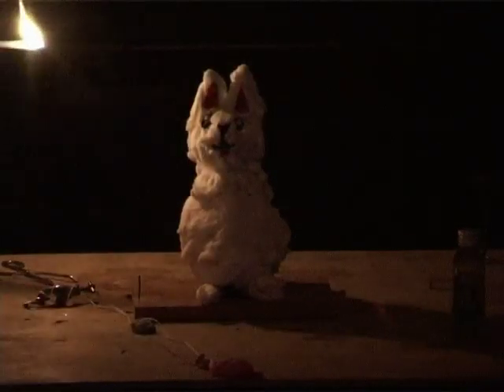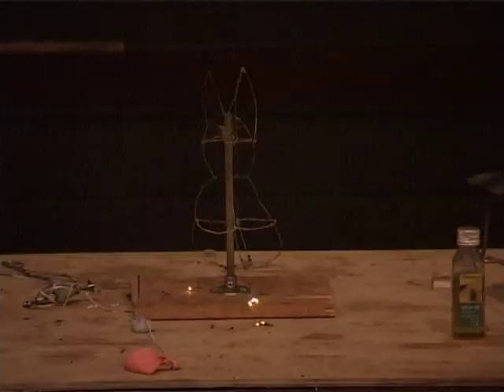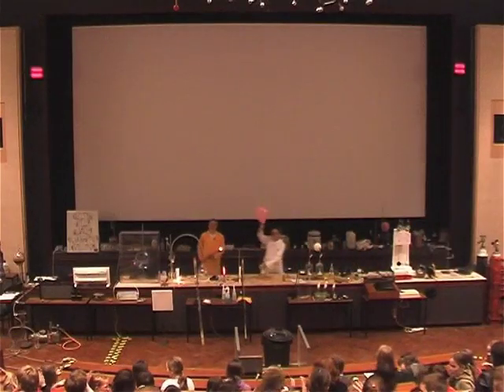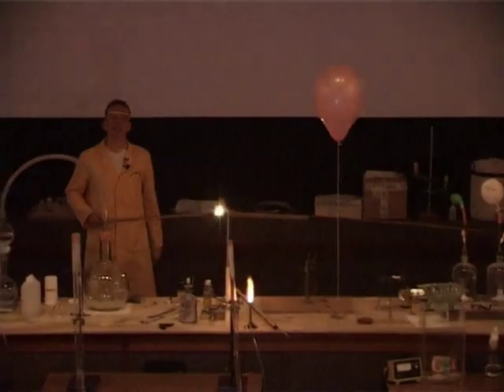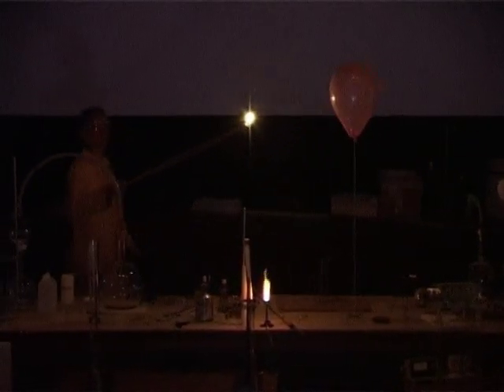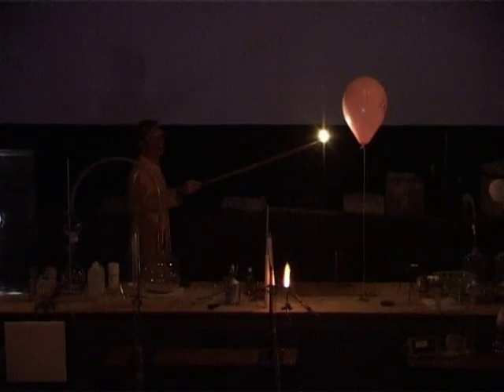So now you see him. Woof. Now you don't. Just in case you missed the bang before, here we go. Hydrogen and oxygen making water. Thank you very much. Woof.